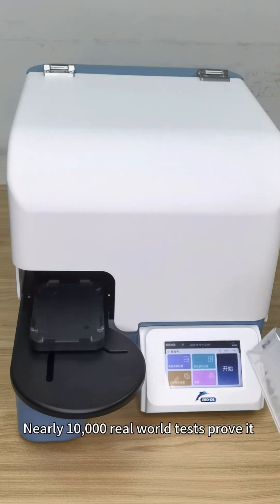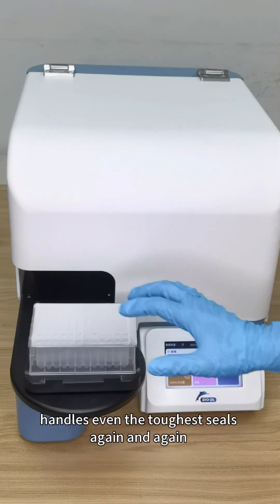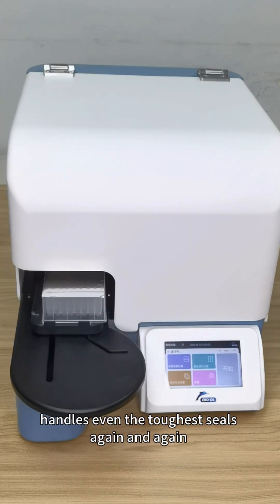Unbeatable reliability. Nearly 10,000 real-world tests prove it handles even the toughest seals, again and again.